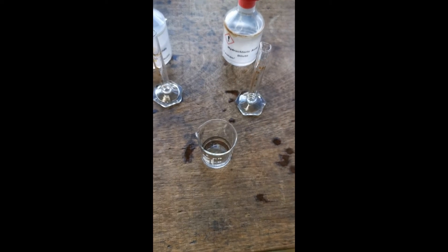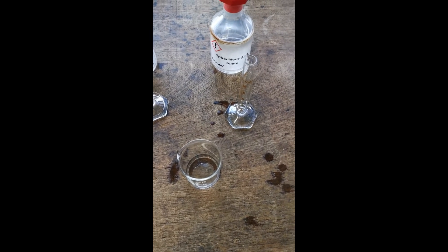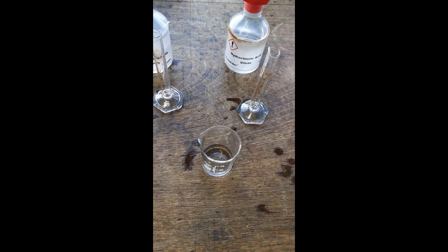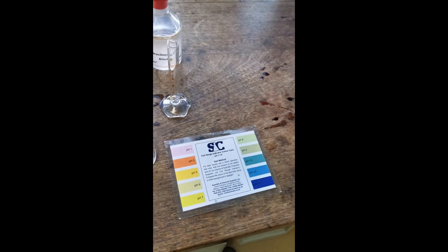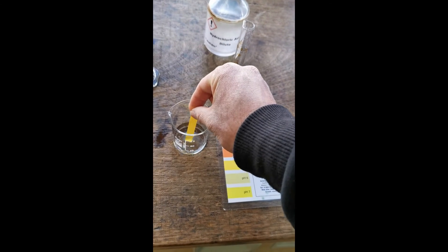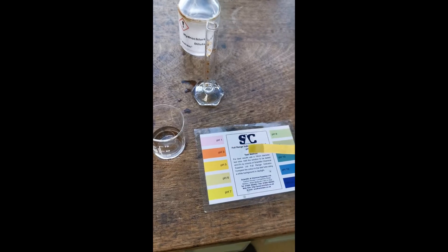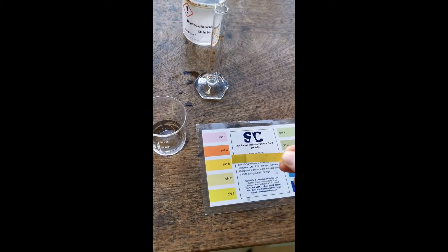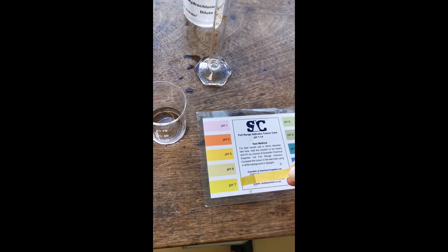Now that we've stirred the mixture for one minute, we're going to test the pH again using a piece of universal indicator paper and compare the colour to the pH chart. We can see that the products of the reaction between hydrochloric acid and sodium hydroxide are neutral — they have a pH of 7.